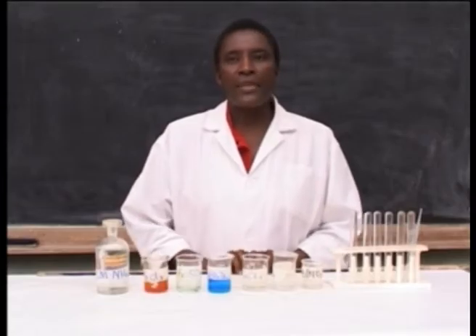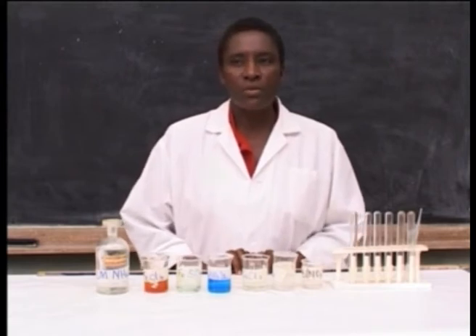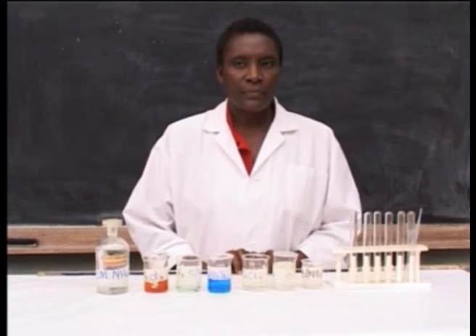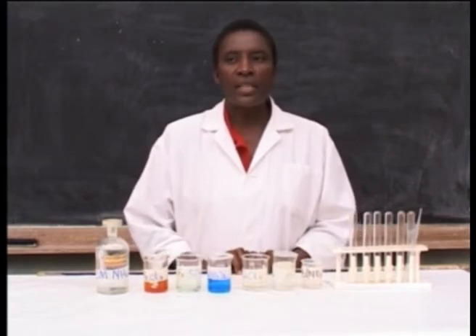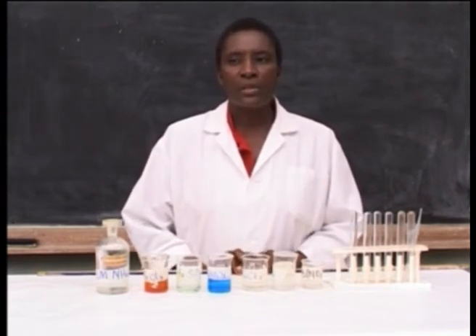Another experiment: precipitation of ions from their solution by using ammonium hydroxide. Introduction: salt solutions react differently with ammonium hydroxide solution.